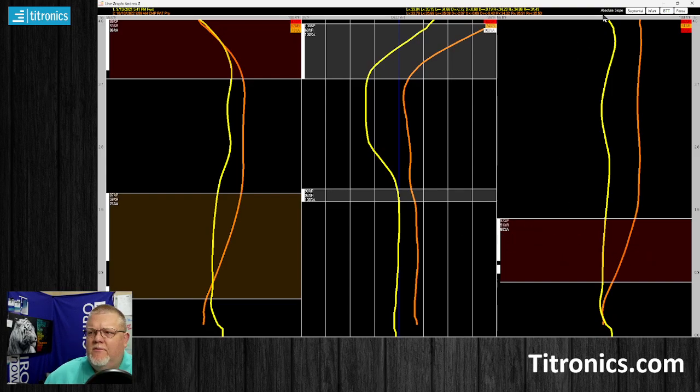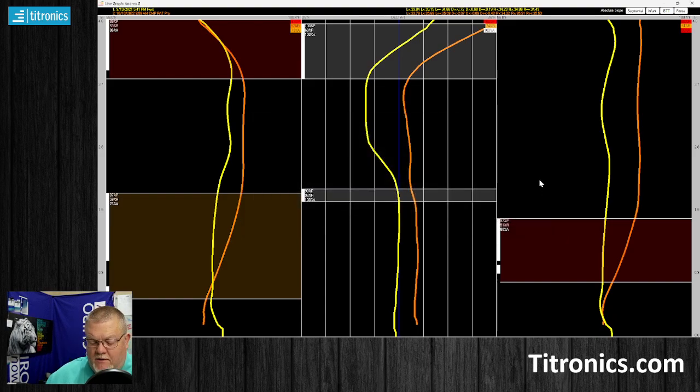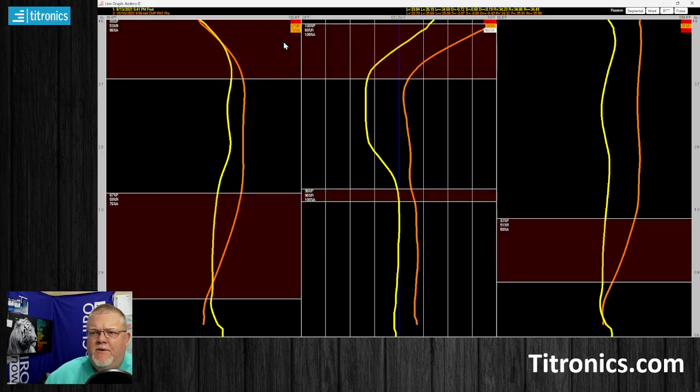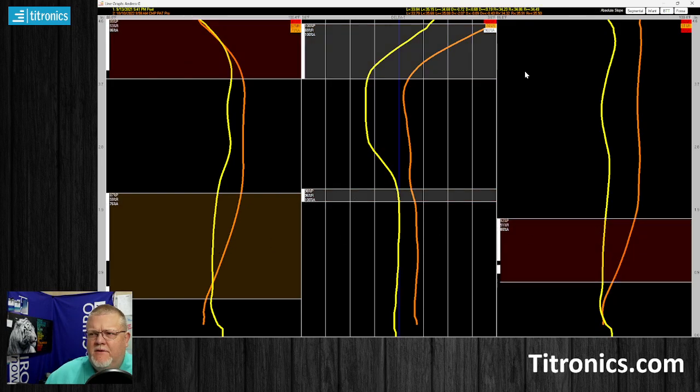So that's the 3. We can also click right here or hit the T. I'll show you again, we go to the next stat type. We're showing all 3 of them here. If I hit the T, it's just going to show us none, just the areas that we had selected. Here's the Pearson coefficient only. And you see there are these gray bars here. That's how much at that area they're alike. This is the relative slope, and this is the absolute slope.